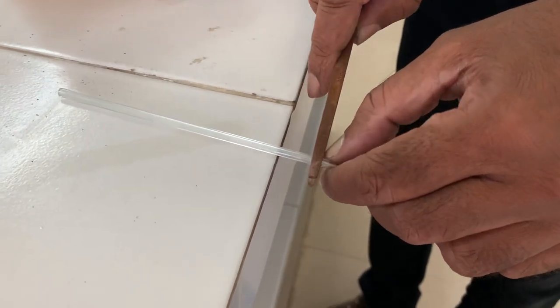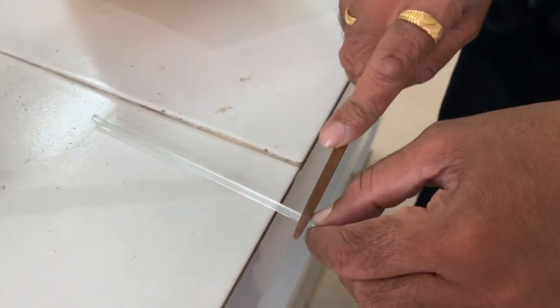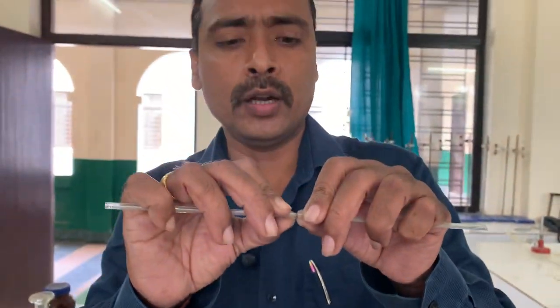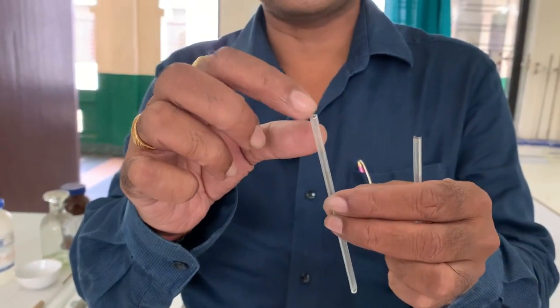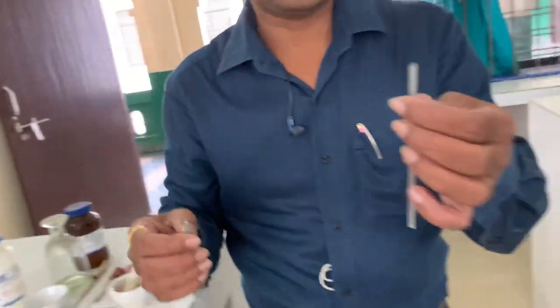You move the glass tube and scratch with the file. Move, then scratch. After some time it will be scratched in a round form, then it will slightly break into two pieces. The edges will be very sharp.